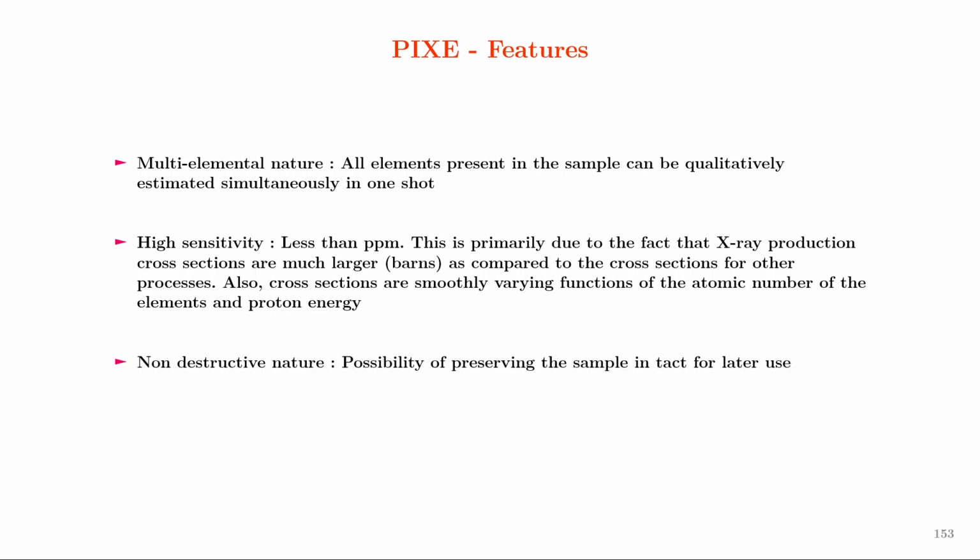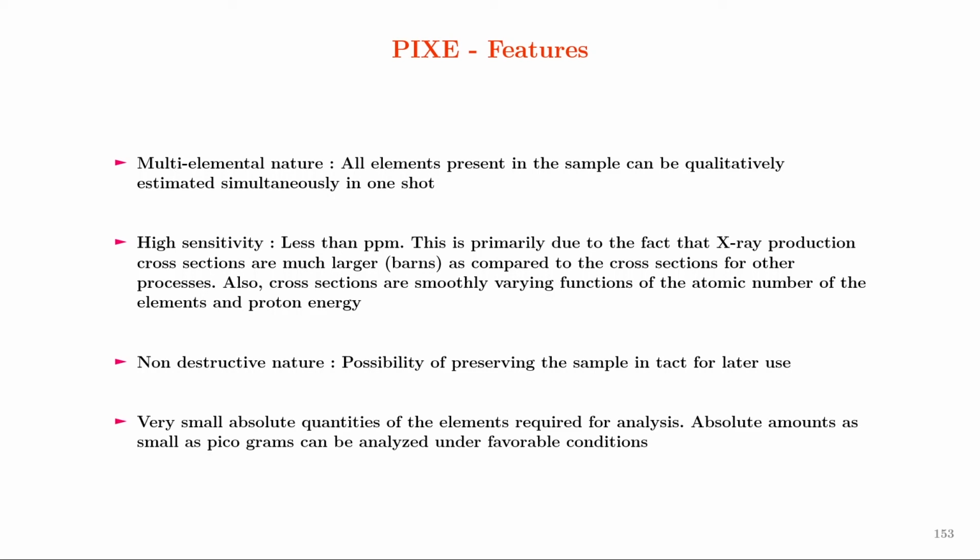Non-destructive nature. It has the possibility of preserving the sample intact for later use. And finally, very small absolute quantities of the elements are required for analysis. Absolute amounts as small as picograms can be analyzed under favorable conditions.